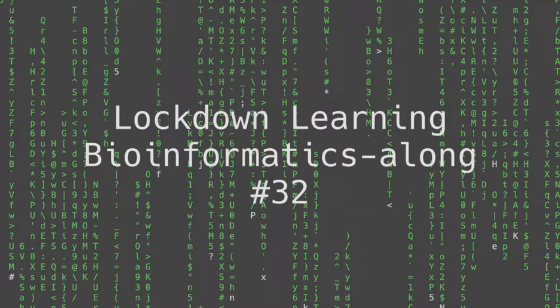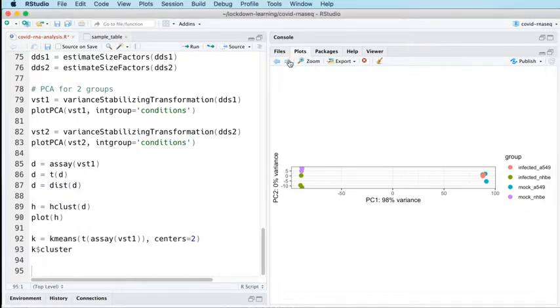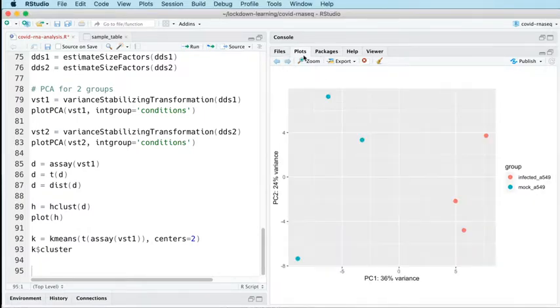And our initial PCA, which you can see here, really demonstrated that what we're dealing with here is 2 experiments, not 1 experiment. So we split our data set up and then looked at the principal components of each of those experiments individually, and they look much more like real, quote unquote, real RNA-Seq experiments. These look the way that I would expect an RNA-Seq experiment to look.